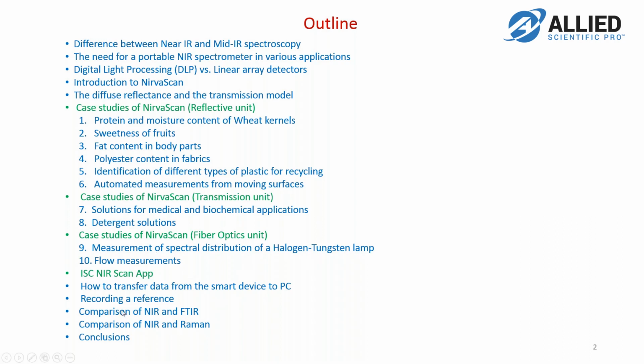Then we would look at the app for the NirvaScan, which is called ISC NIR. And then we look at how to transfer data from a smart device to the PC, and how to record a reference. And at the very end, we would compare the Near IR method with the FTIR, which is in mid-infrared, and then we also compare Near IR with the Raman method. And we end with some conclusions.